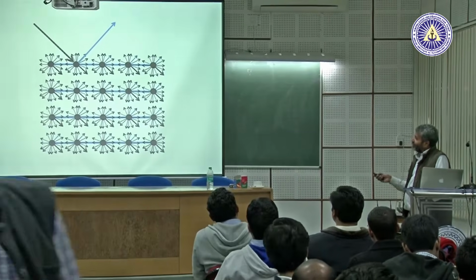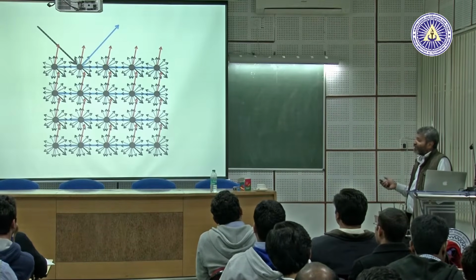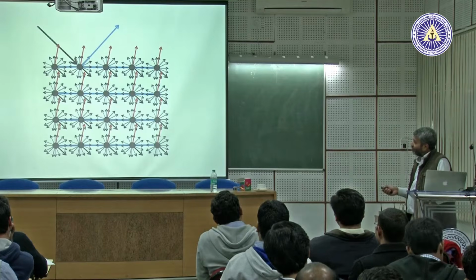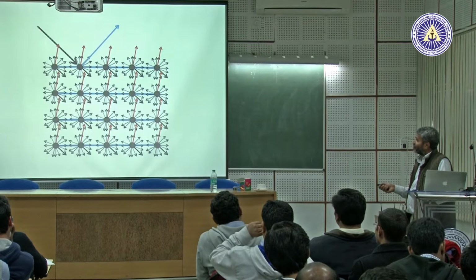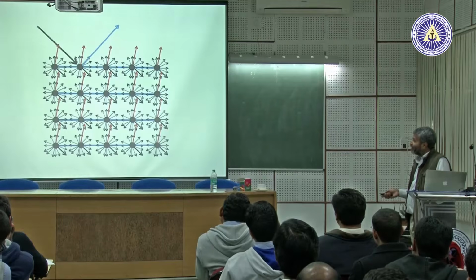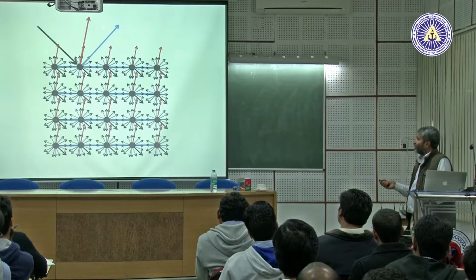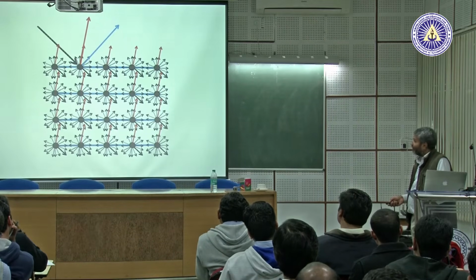Of course, the beam may not be adding up only in this blue direction. Suppose this red direction, because each atom is giving beams in all directions. It may happen that in some other red direction also the beams add up and are in phase, but then that does not appear to be a mirror reflection from the blue plane. Do not worry, Bragg said.